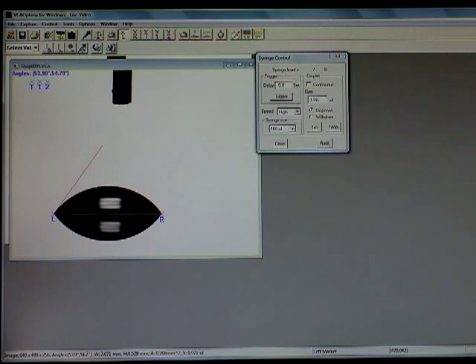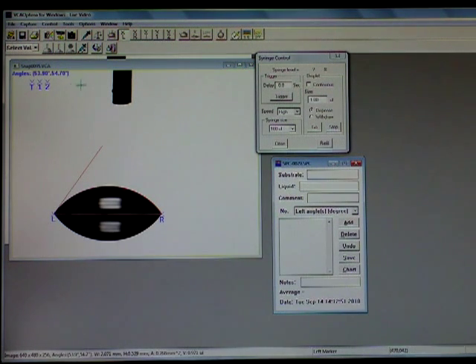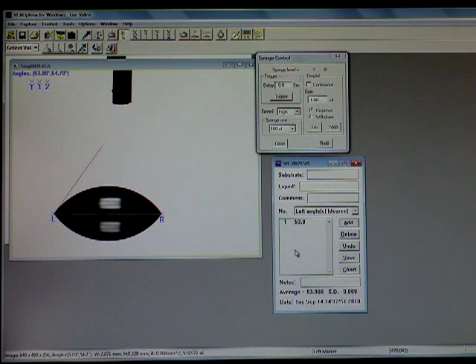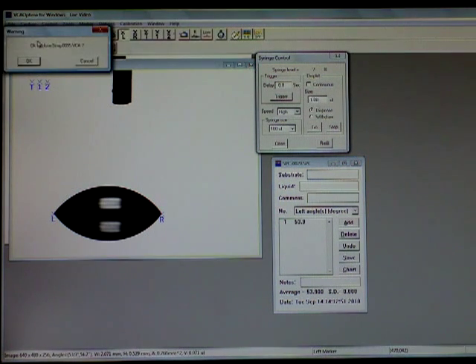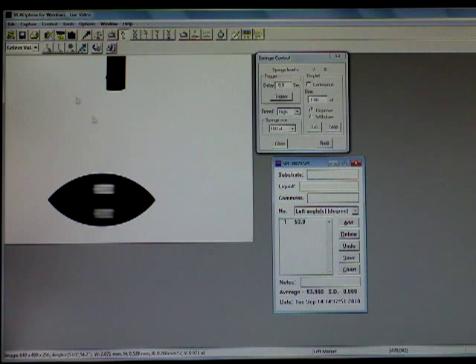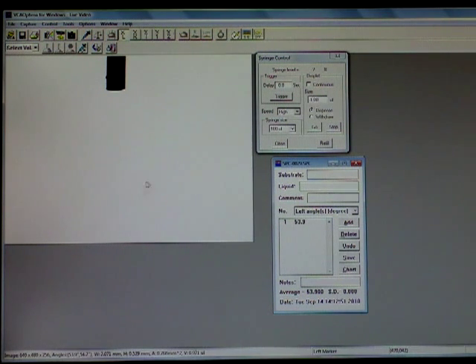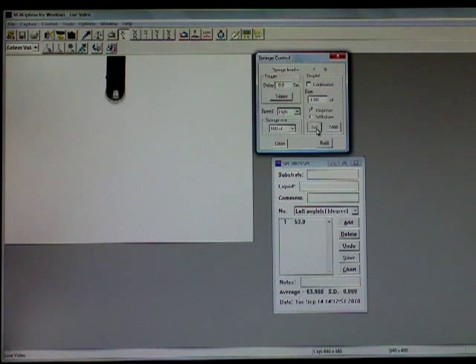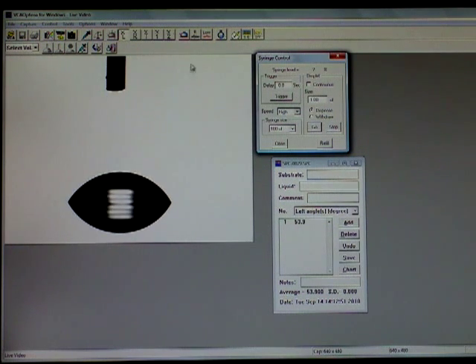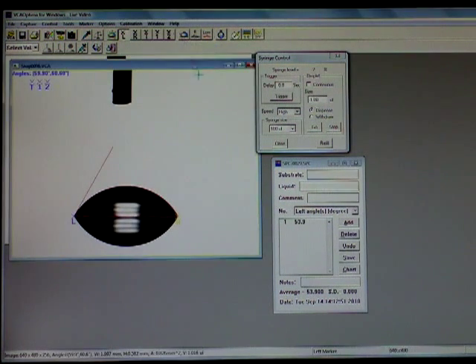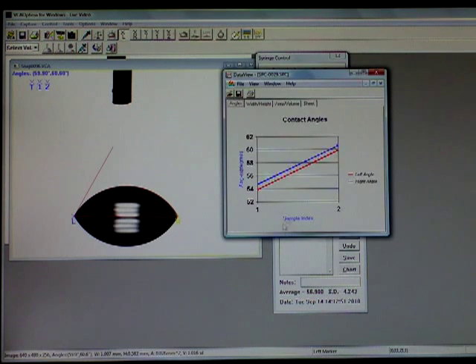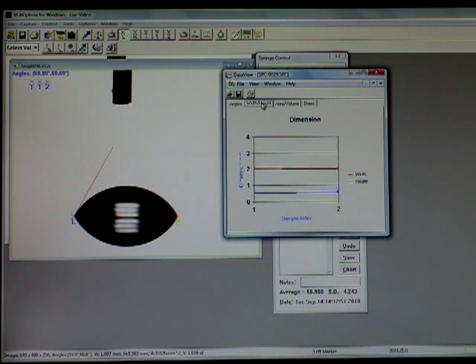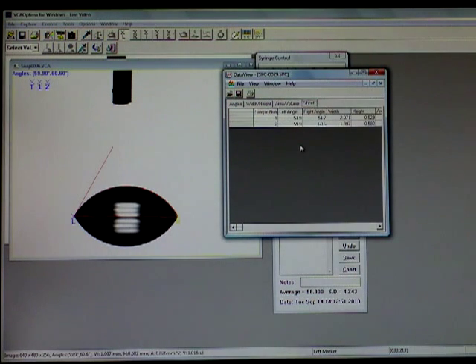One of the features I'll show you is the SPC file. This is a data saving file. I can hit add and this will add the measurement I just took automatically. This feature will allow you to take multiple measurements on a surface so that you can add it and then chart it, whether it's by contact angle, width and height, area and volume, or to a workbook which then can be exported to Excel.